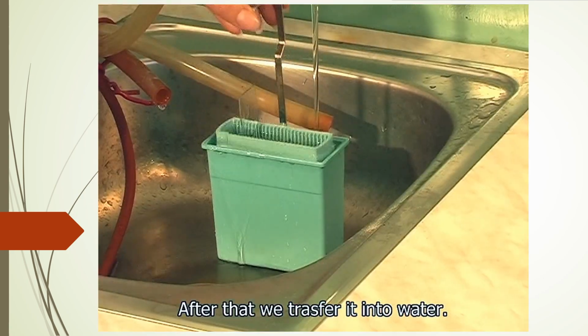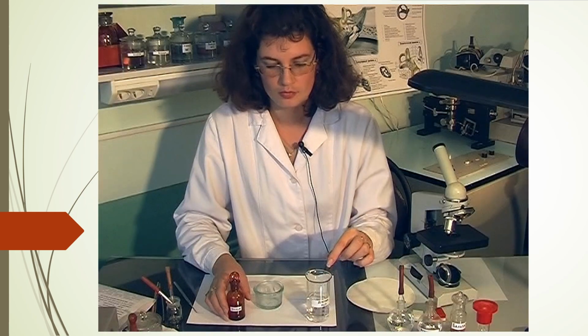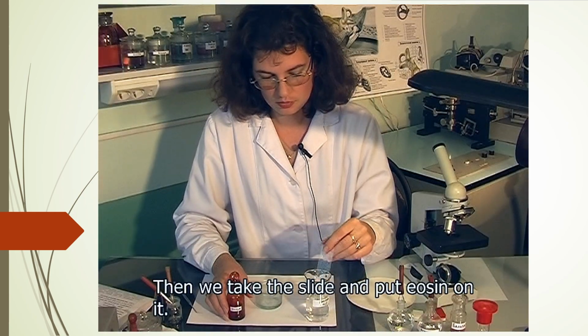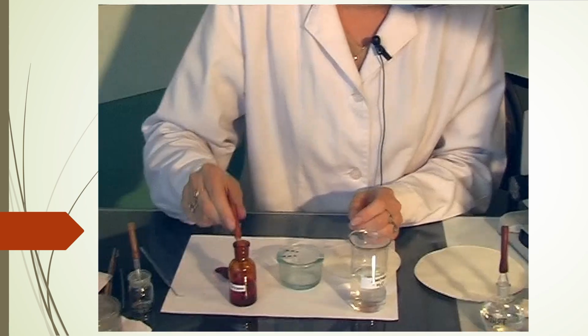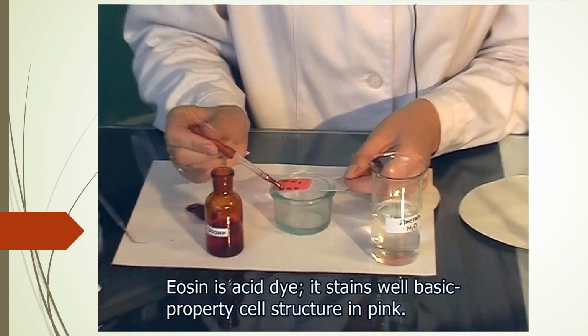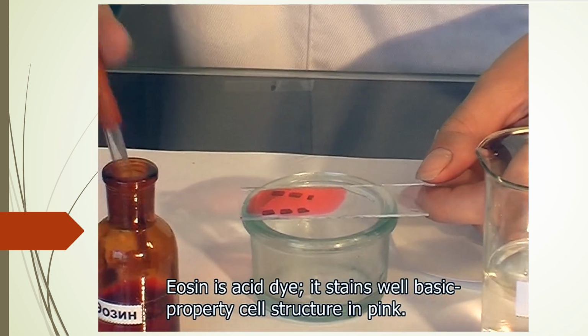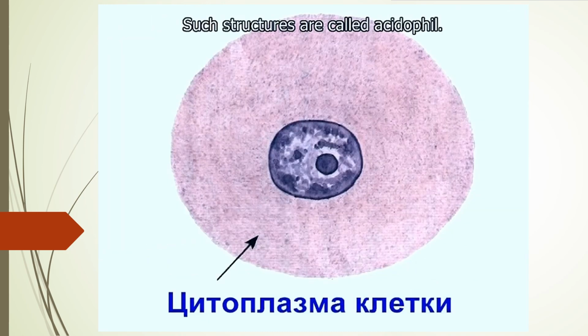After that we transfer it into water. Then we take the slide and put eosin on it. Eosin is an acid dye. It stains well basic property cell structures in pink. For example, collagen fibers and cytoplasm. Such structures are called acidophil.